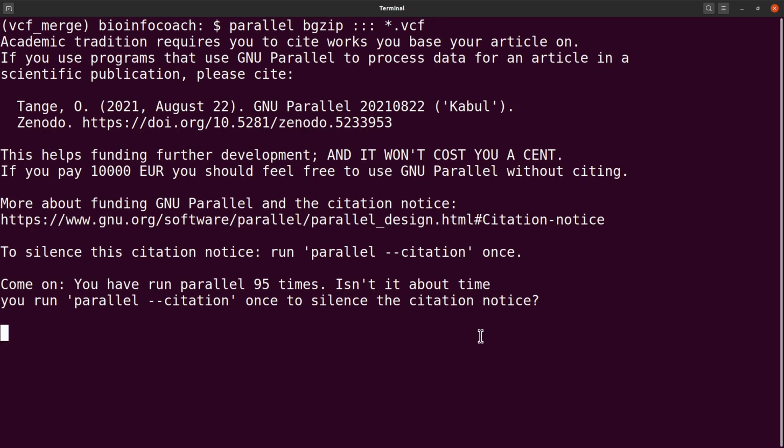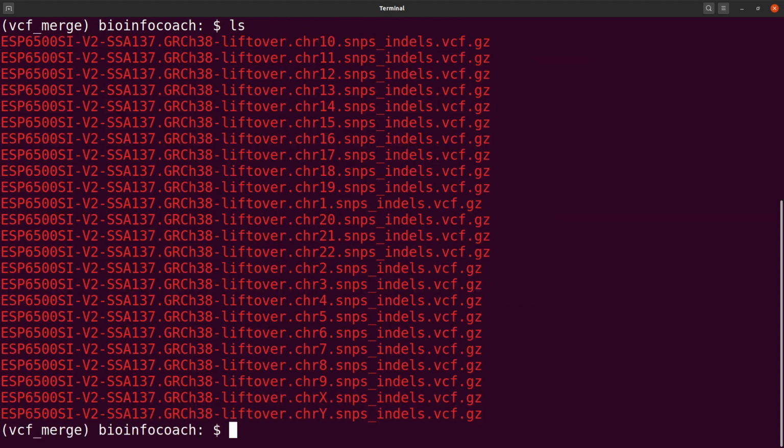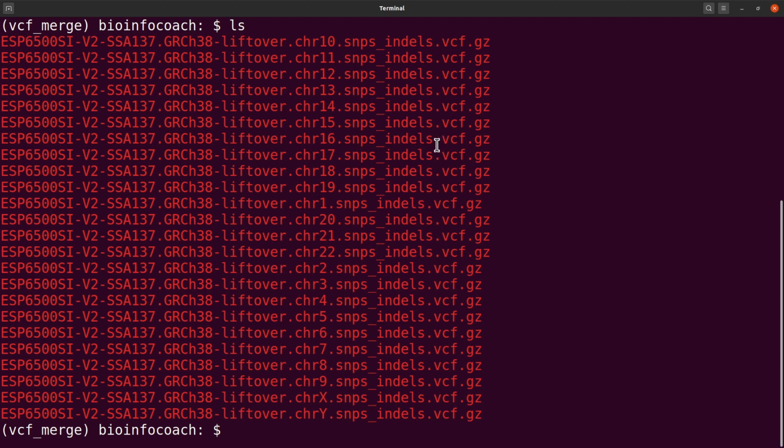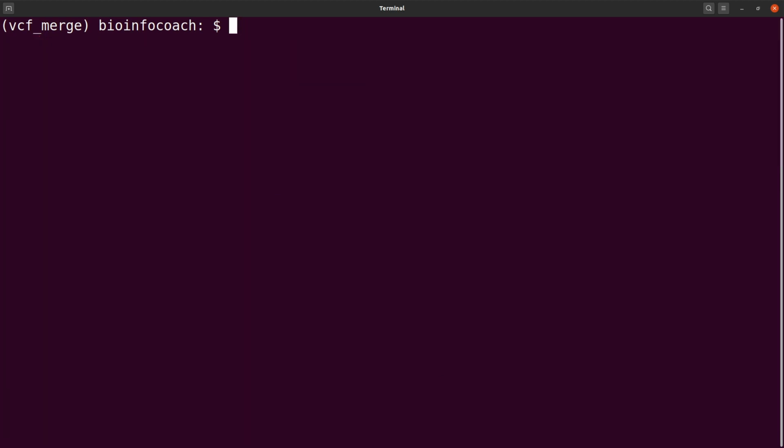Okay, so the files have been compressed. Let's do an ls. So you notice what we have here now. Formerly it was .vcf, but now it's .gz because we have compressed it. So that's what we need.